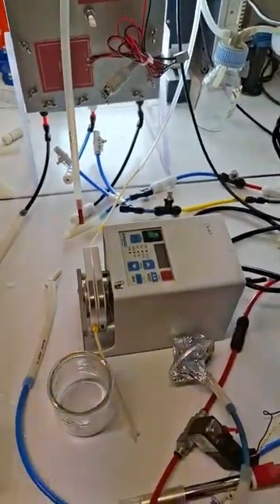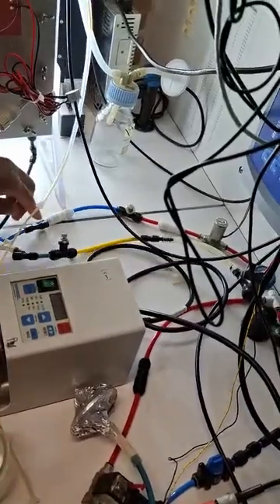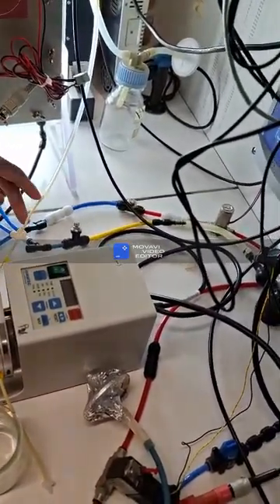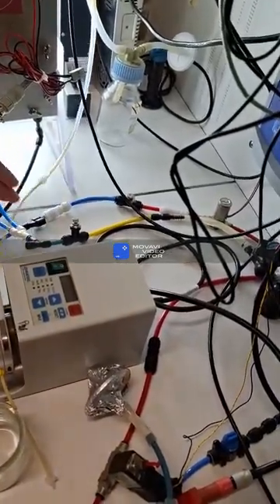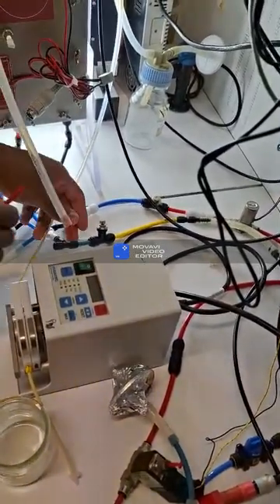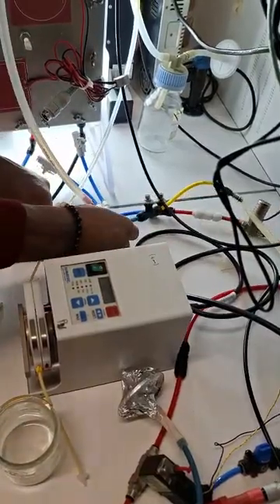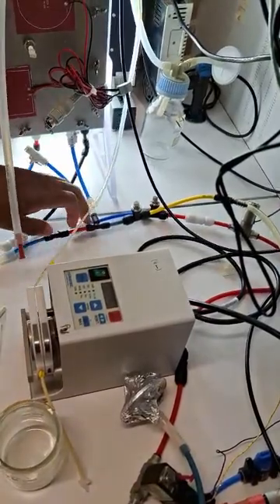And why did you separate the carbon and air here? Why did you decide to connect it with a T-bolt? Because you need to homogenize the system, so you will have a higher flow of carbonic gas, air, sorry.